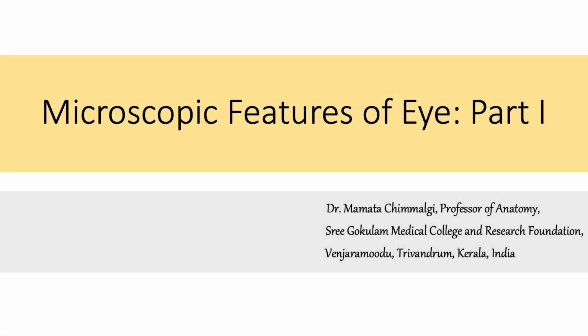We will be considering the microscopic features of the eye in 5 short video segments. This is the first introductory part.